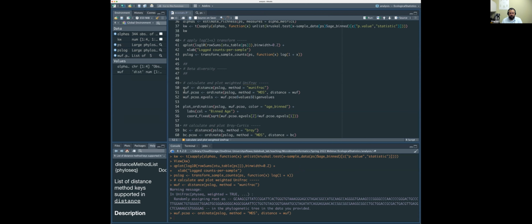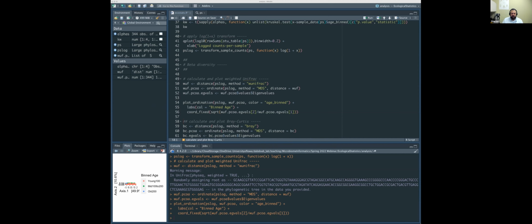So you can see here we have a rectangular plot, with the length of the axes based on the variation across the axis. Almost 50% of the variation in the data set is captured by axis 1, but only 10% of the variation is captured by axis 2.